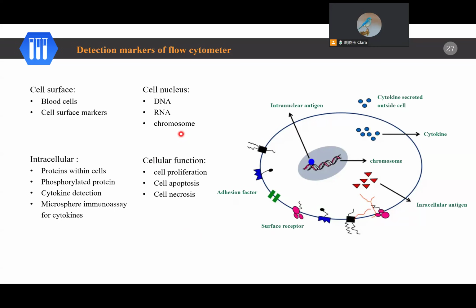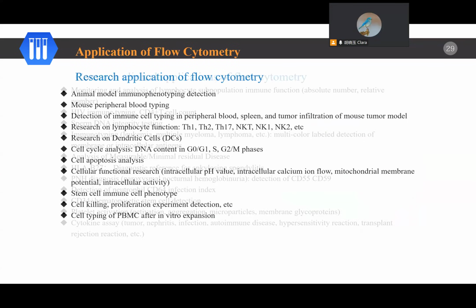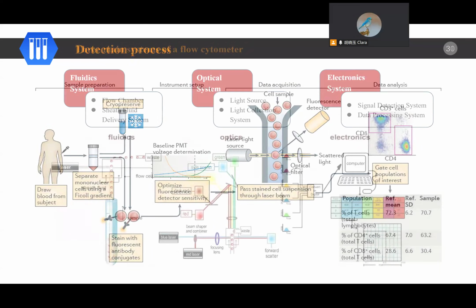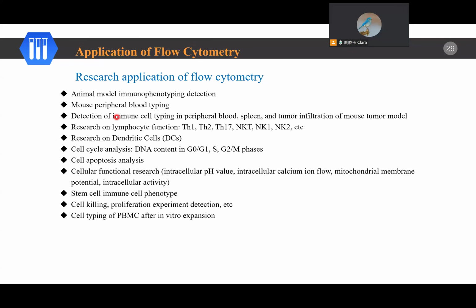Okay, here's the principle. Sorry, not that one. In the following slide, I will show you the test items that have already been detected or already matured in our flow cytometer system. So this is the list of test items.